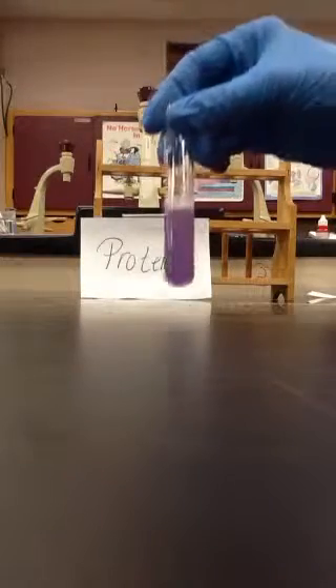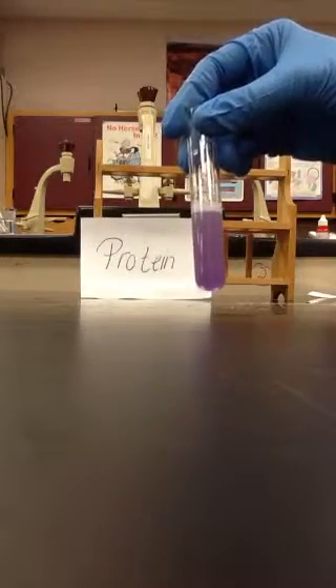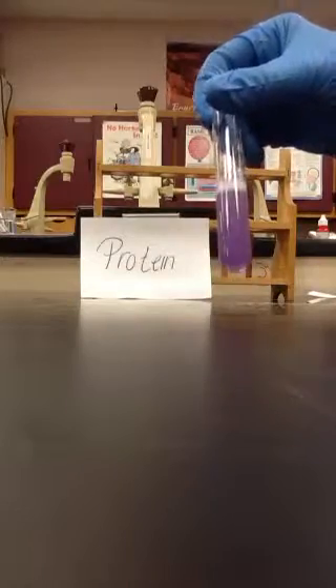Your sample is probably going to have to sit for a little while, but this pinkish purple color is a positive result. The directions do say to let yours sit for a few minutes to see if you get this pinky purple color.